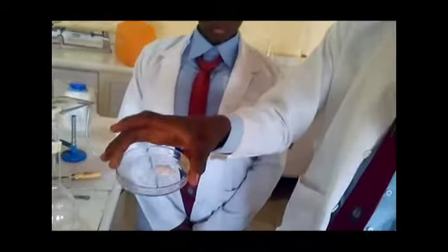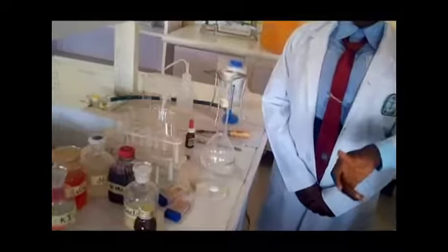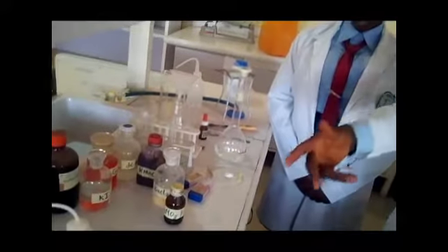Our sample could be in solid form like this or in liquid form, and we will always be asked to determine the cations and anions present in such samples using the reagents that I will mention. And what are reagents? Reagents are chemical solutions which react with certain cations and anions to give characteristic reactions.